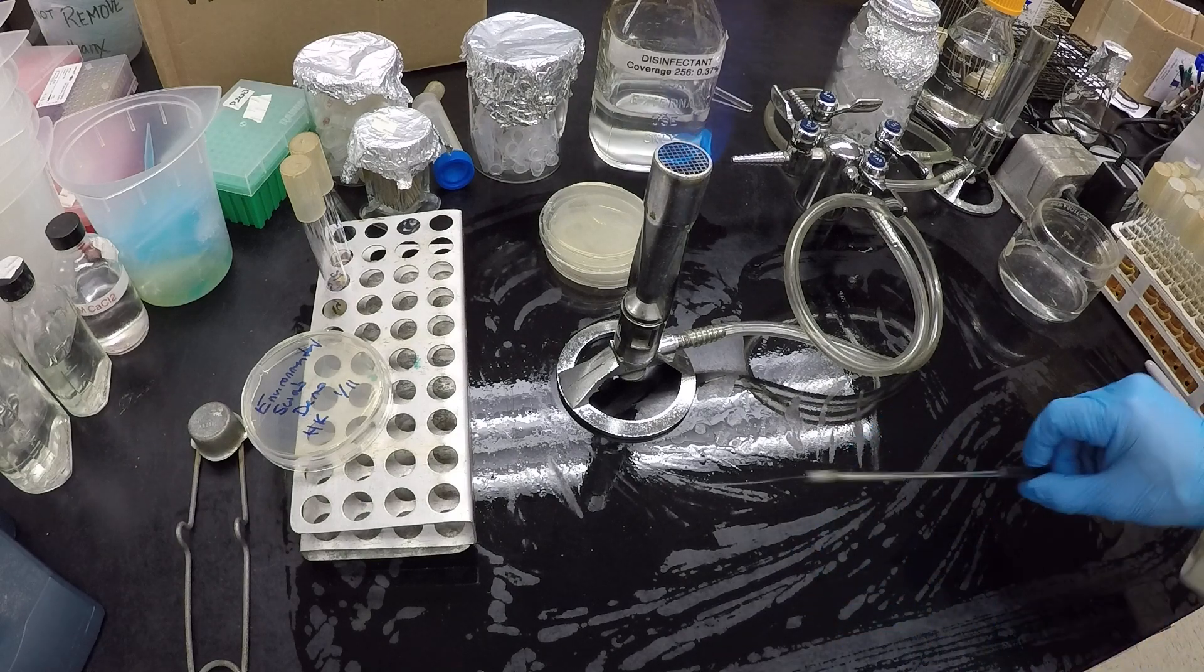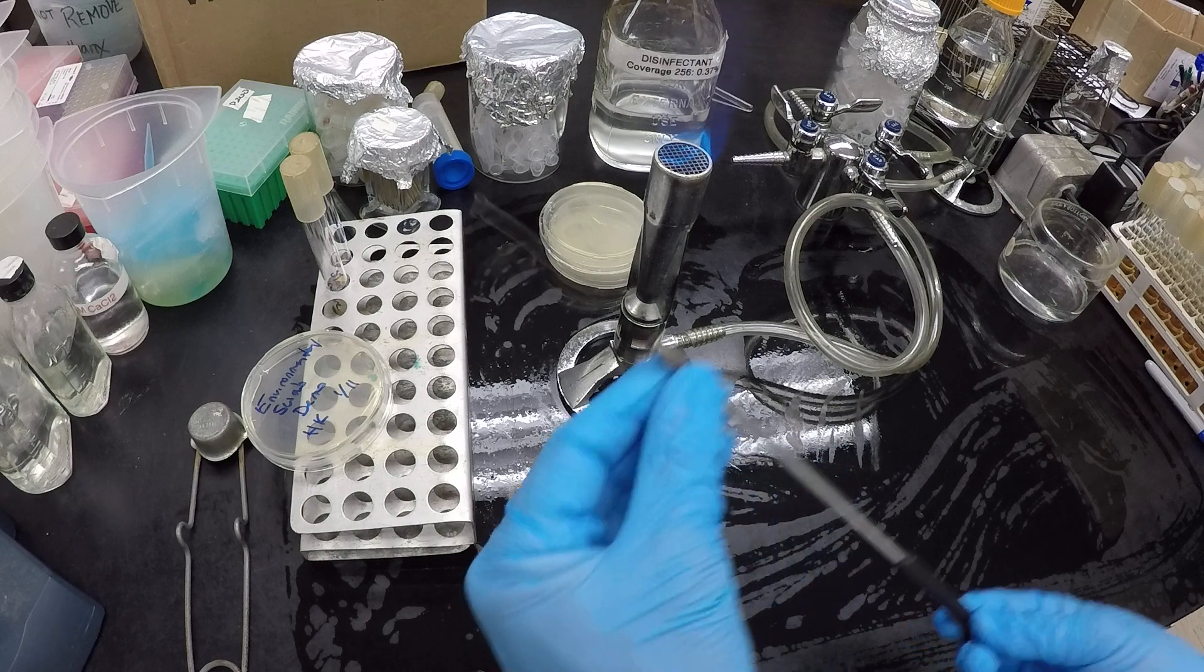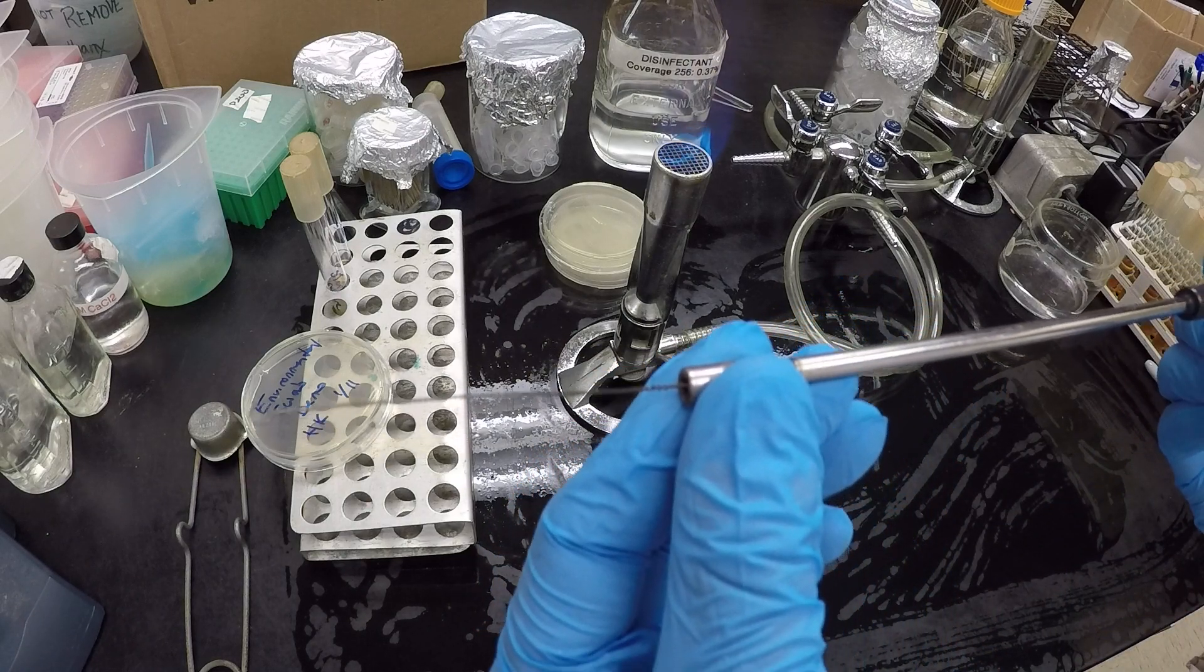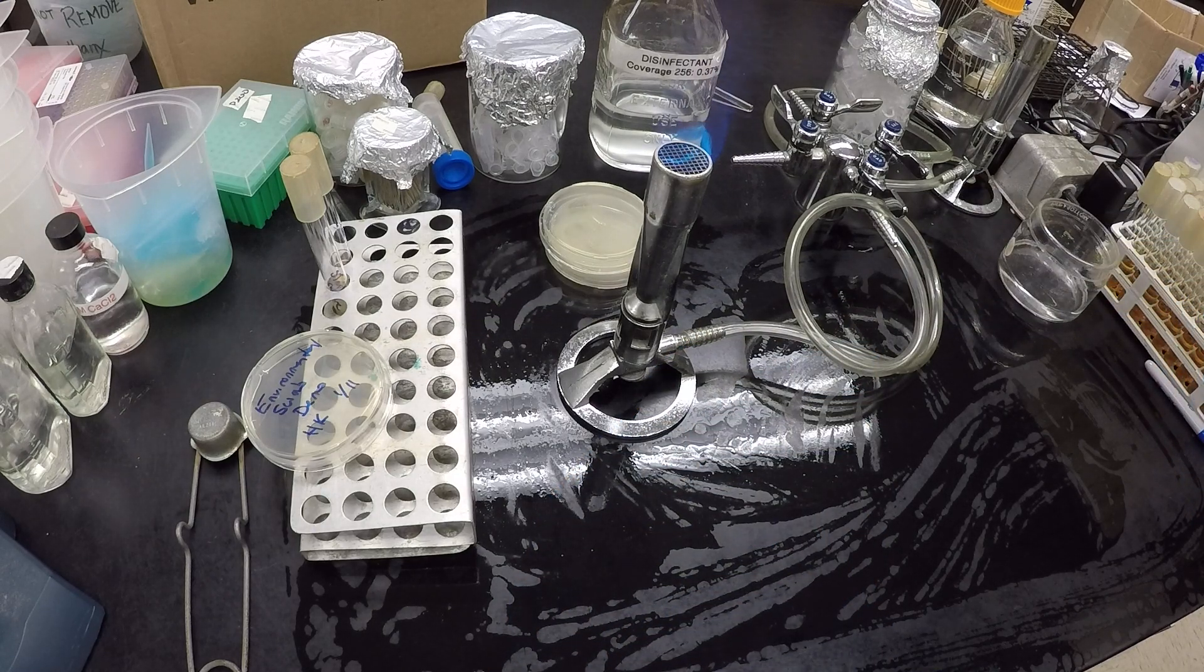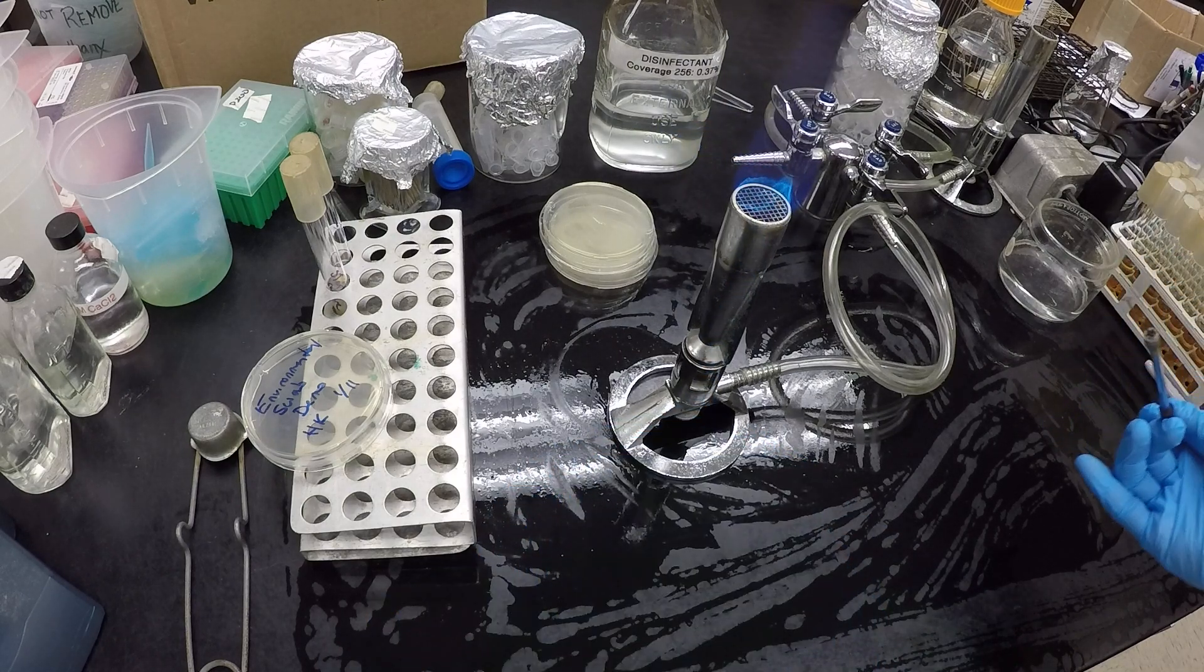The third is the tools that we're going to use. And this is our sterile loop. Oh, sorry, our loop. This is what we're going to use to manipulate bacteria with, and we will see this many times throughout the semester. In order to sterilize this, we want to make sure that we stick it in our Bunsen burner, which we learned how to light on the first day of class.